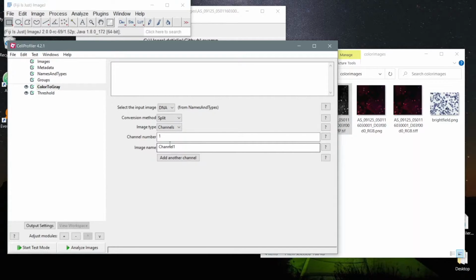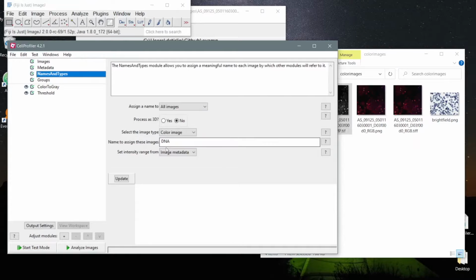And that would be geared towards this kind of composite scenario. One of the important things about the composite mode of storage is that you can actually have more than just the conventional red, green, and blue channels. You can have as many channels as you want in that image, so you may need to take out many individual channels. Now, there is another way we can handle this though.